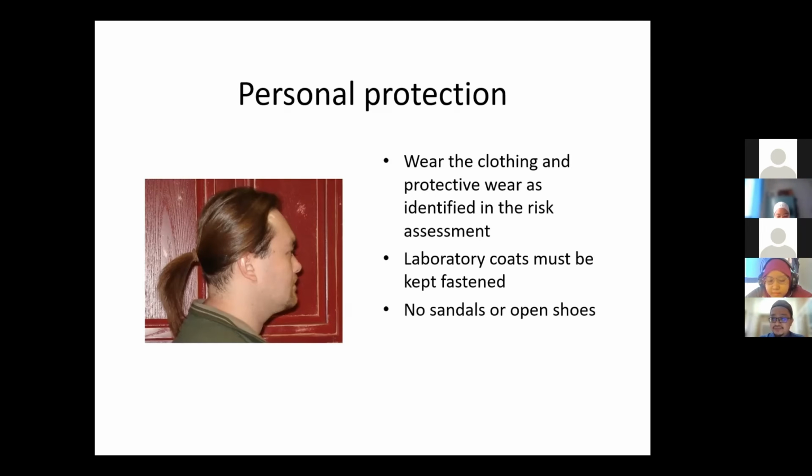No sandals or open shoes. Okay, no sandals or open shoes. Even myself when I go to the lab, maybe you see me around the campus wearing sandals, tapi in the lab, yes, I will change. Memang kena. Long hair must be tied back.